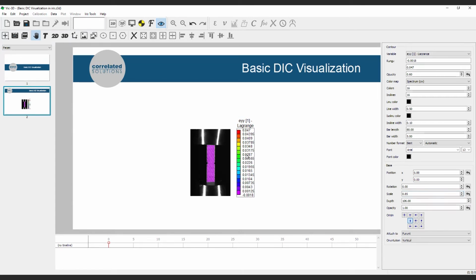One helpful hint to clean up the look of the page is to make consistent the number of decimal places. To do so, change the drop-down beside Number Format to Number and choose how many places you need. Here, we'll choose 3.